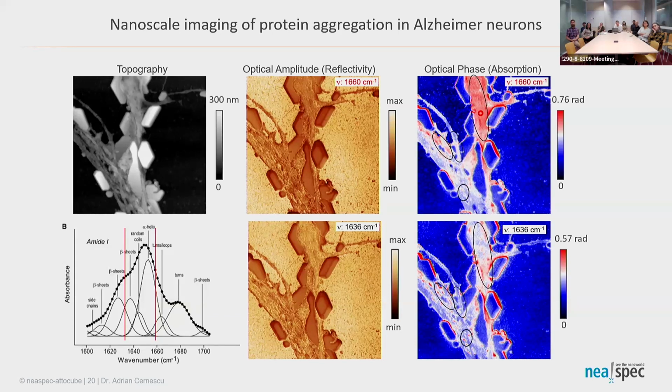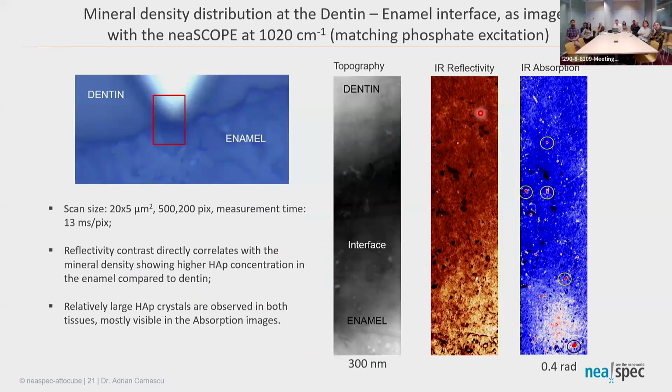All right, this is, let's say, more on bio, but also something that some people I know are looking into: biominerals. So it's a mixture of organic and inorganic. These are measurements that I did on the tooth. And you are at the interface between dentin and enamel.